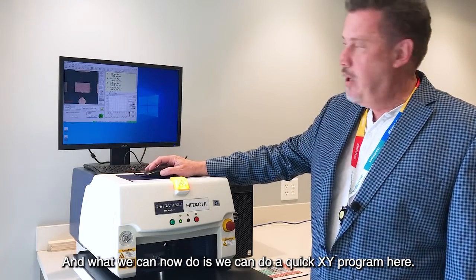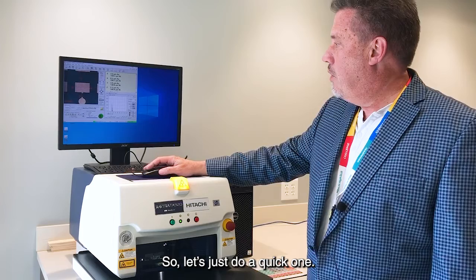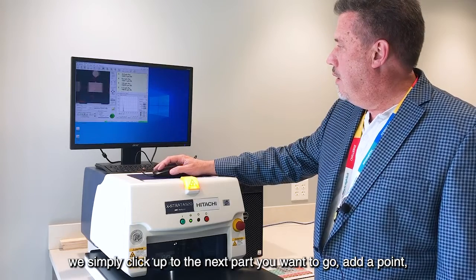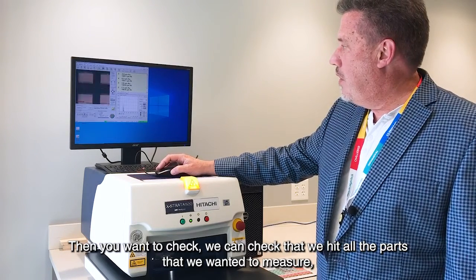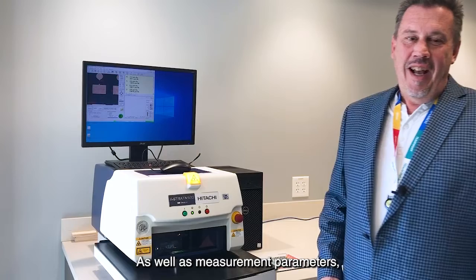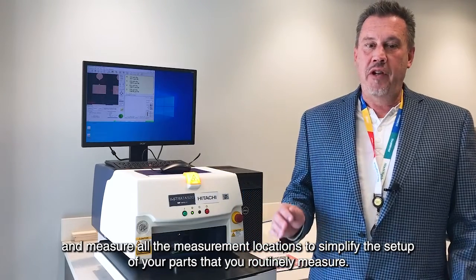What we can now do is run a quick XY program — it's very simple. We can do multiple points, a line program, a grid program, or scans. We add a point by clicking on the part where we want to go, then add another point, and check that we've hit all the parts we wanted to measure. The machine will go down and measure each point. Once you're happy with it, just hit go and we're all set. Pre-configured applications can also use a stored XY program to automatically navigate to and measure all measurement locations, simplifying setup for parts you routinely measure.